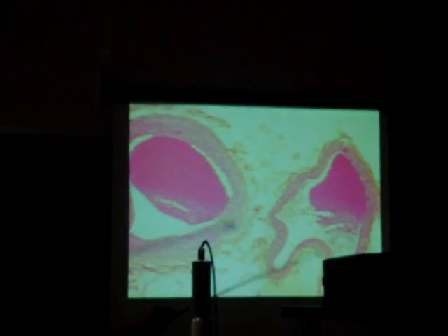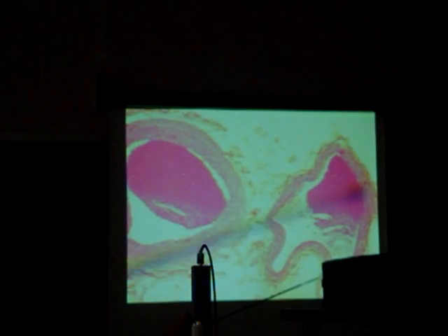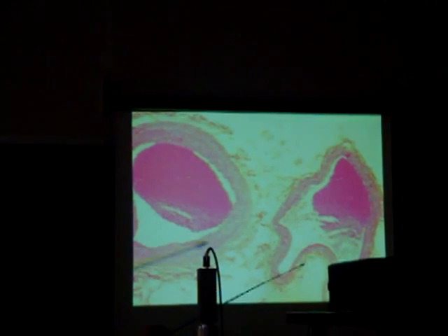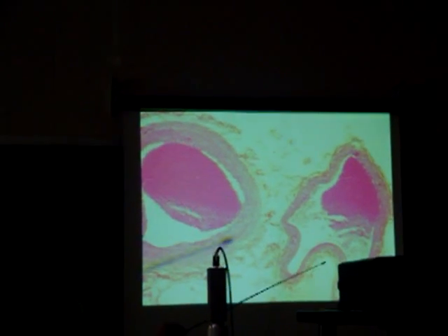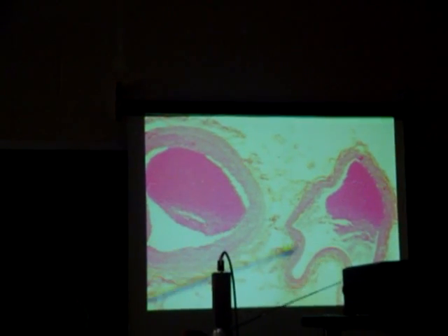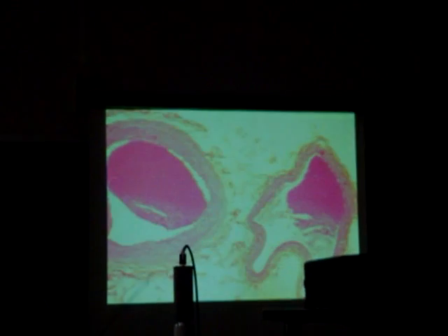Perspective. It's an artery on the left, big artery on the left, vein on the right. Veins are irregularly shaped. Arteries are generally round or oval. Artery has a much thicker wall. That's the key. All that smooth muscle in the tunica media. And then the vein has a thinner wall.